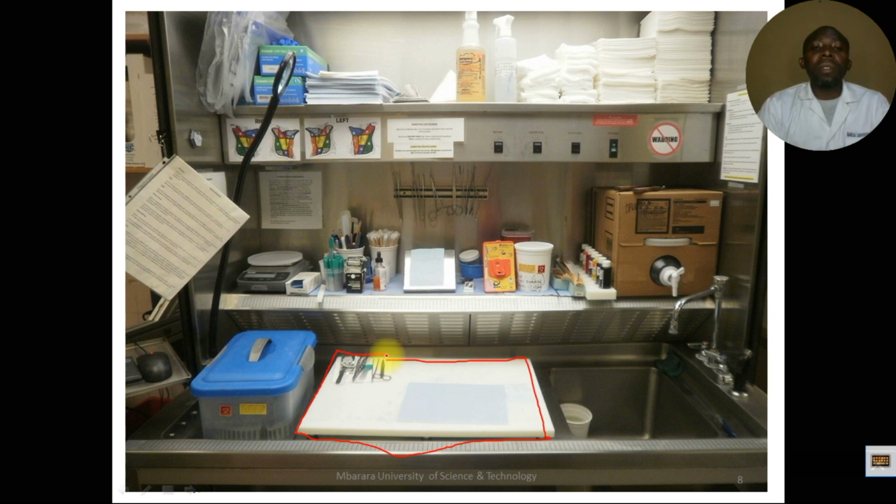We talked about having a lens. So we have a lens here. We can bring it closer so that we can look at our tissue properly and identify those significant areas of interest that can help us to identify the part of diagnostic interest. We have tap water here, with free flowing water when you open, and then we have a number of tools.